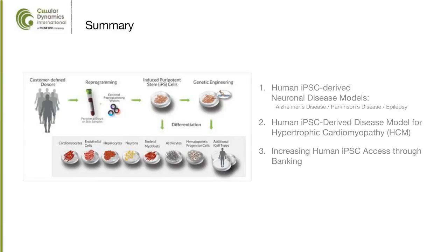Have you investigated other inducers of cardiac hypertrophy? Yes, that's a good question. We have looked at other inducers to really induce and bring out that cardiac hypertrophic phenotype. We have looked at isoproterenol as well as phenylephrine, and all of those that we've tested have shown a response. However, the endothelin was the most robust response in our short assay. So some of the other inducers will work. However, the workflow needs to be adapted a little bit.